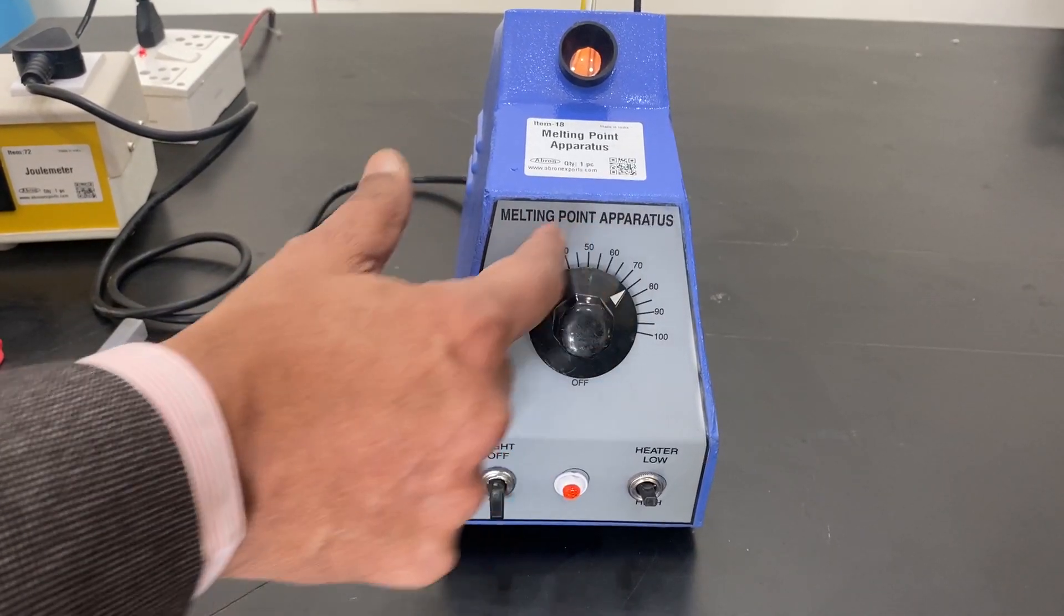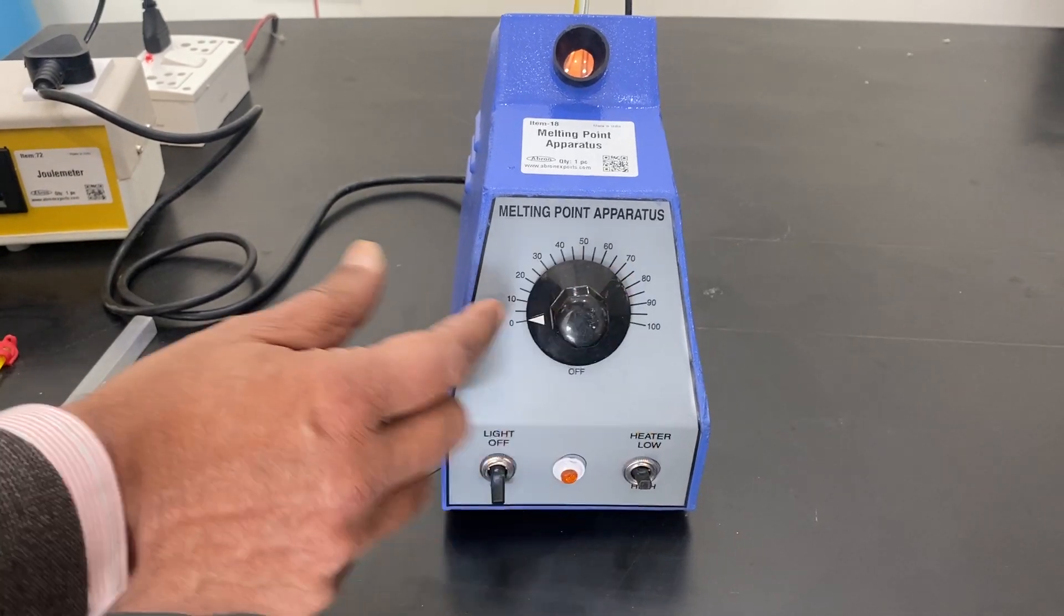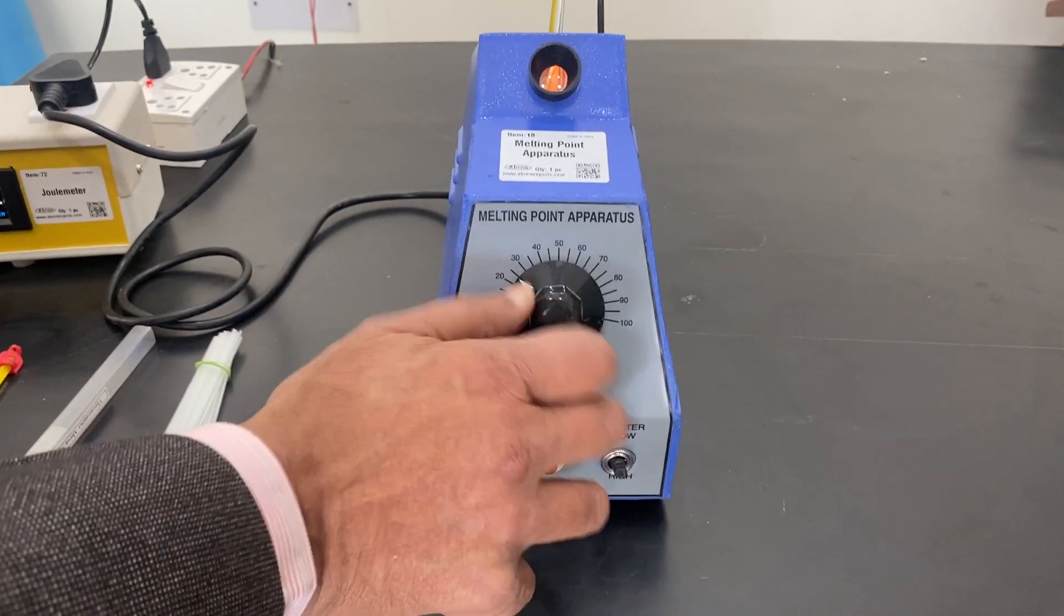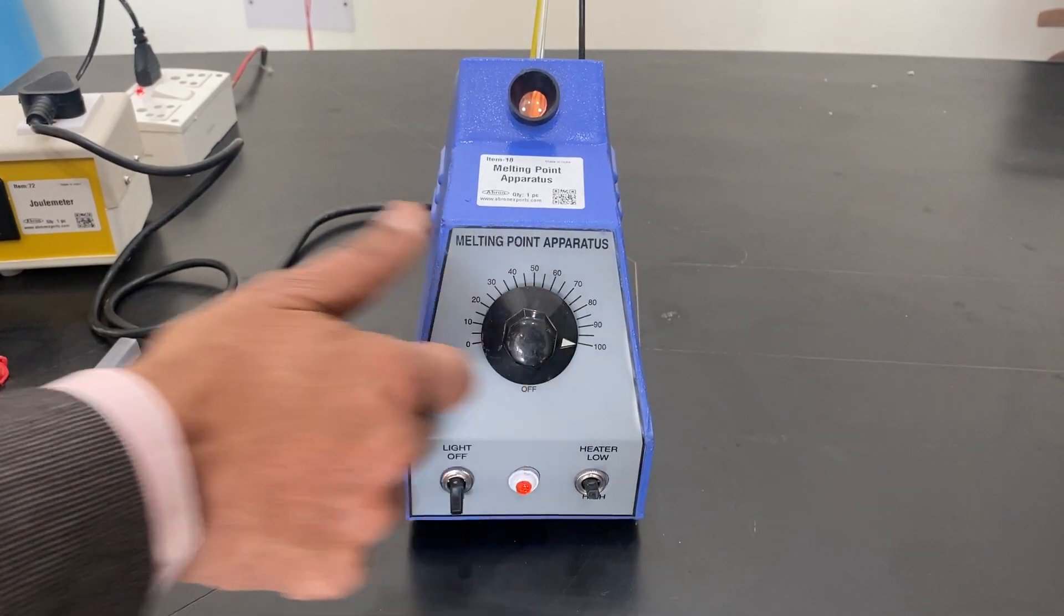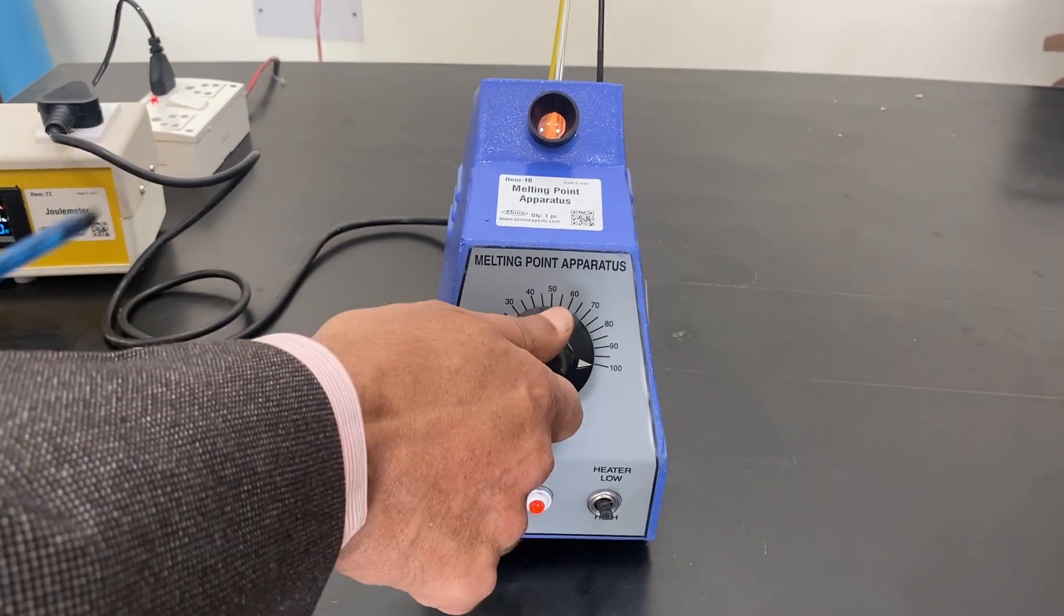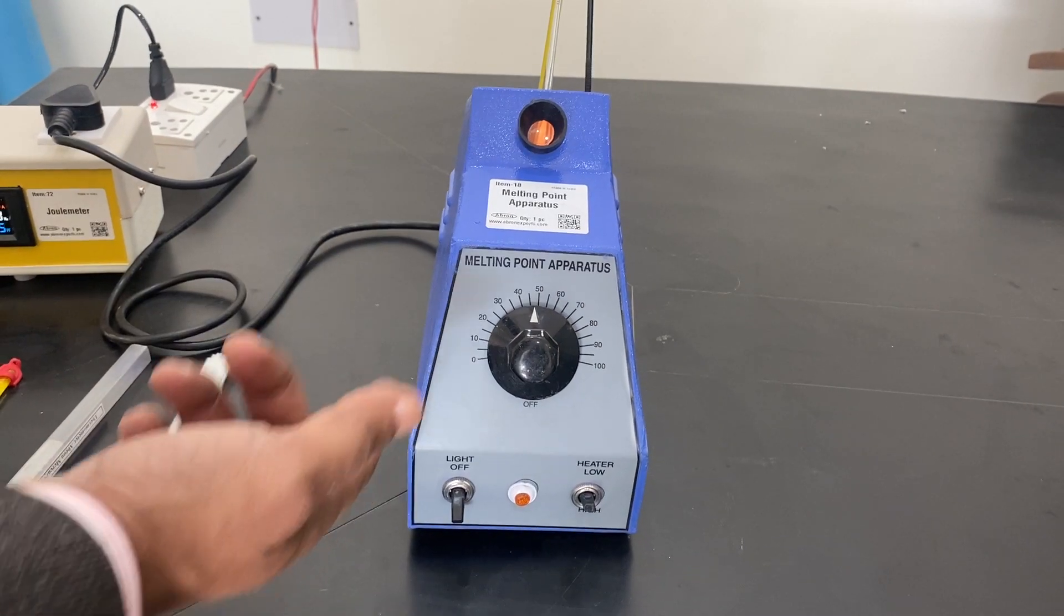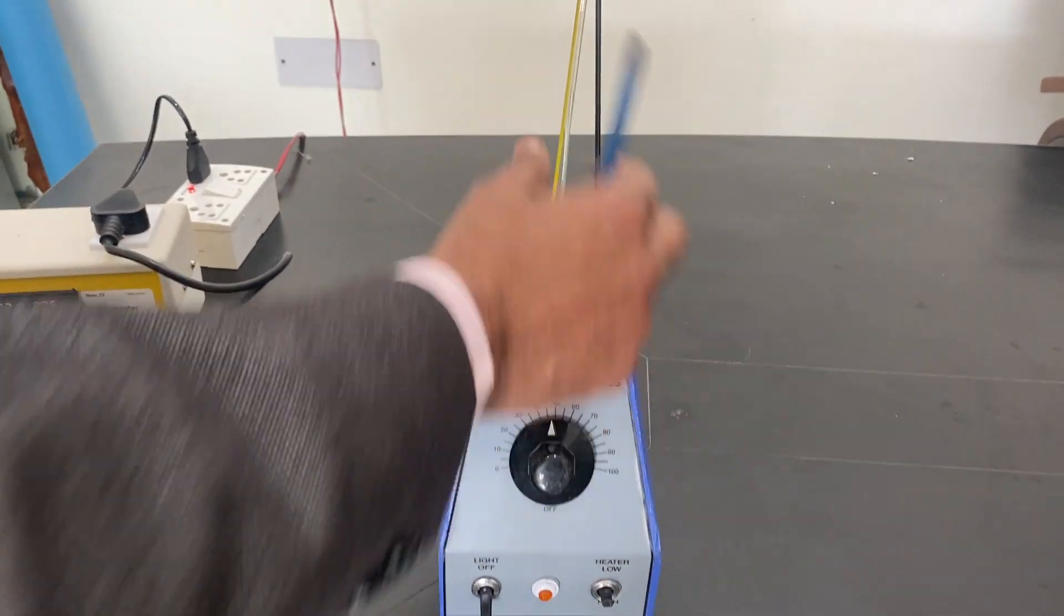This is not a thermostat, this is only the speed of heating between 1 to 30 for slow heating. It's medium heating up to 60-70, and then up to 90 degrees it's faster. Never put it on 100, then it will not stop heating at all. It will keep on increasing.